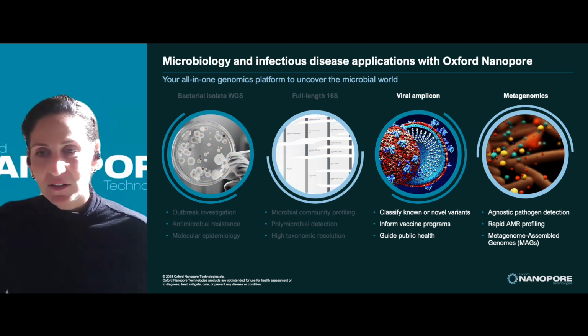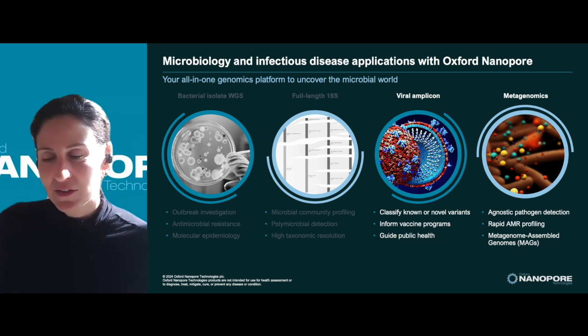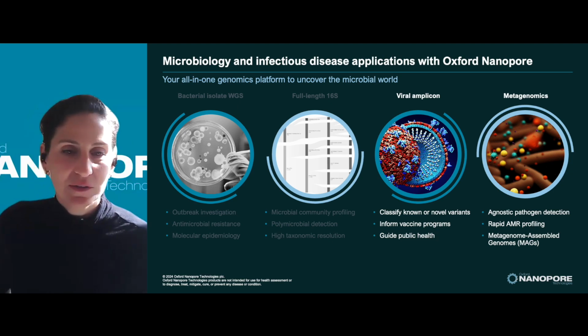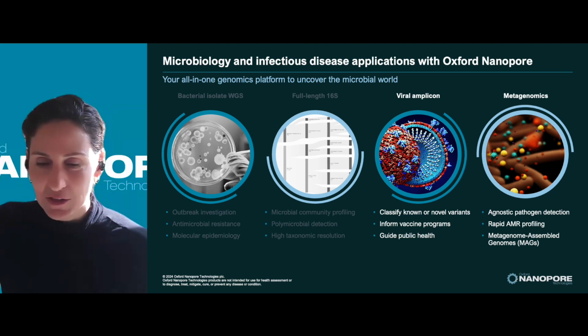And so today we'll have 2 speakers who are going to focus on use cases for RSV viral amplicon tiling, as well as a second speaker who will be talking about metagenomic applications for unknown pathogen detection.